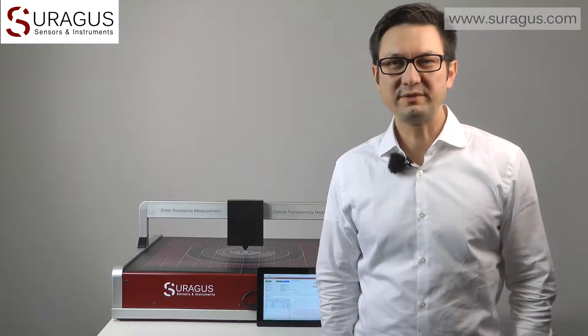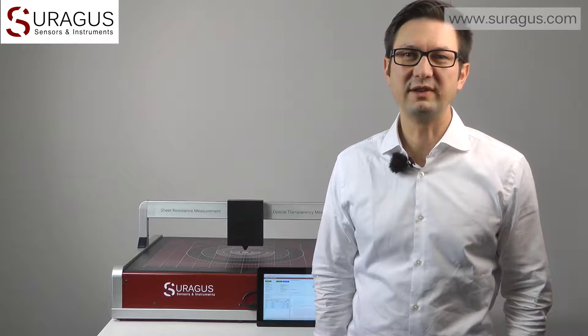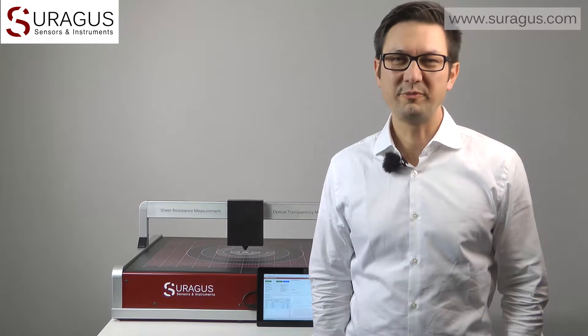As you see, the TFLAB 4040 is the perfect tool to investigate the non-contact sheet resistance of large area samples. Hope you enjoyed, take care.